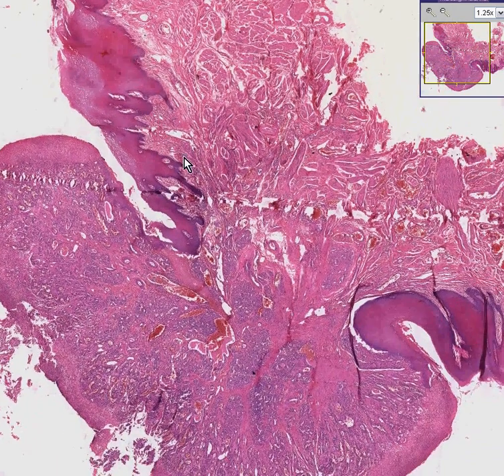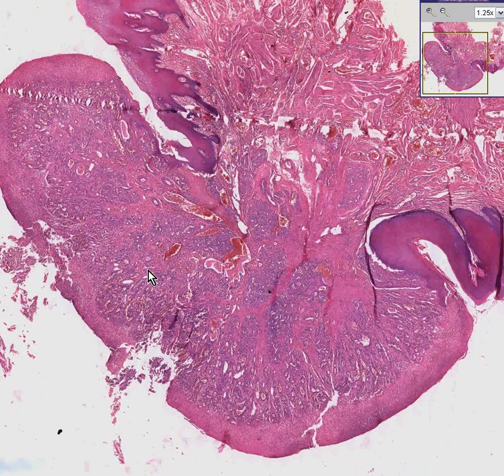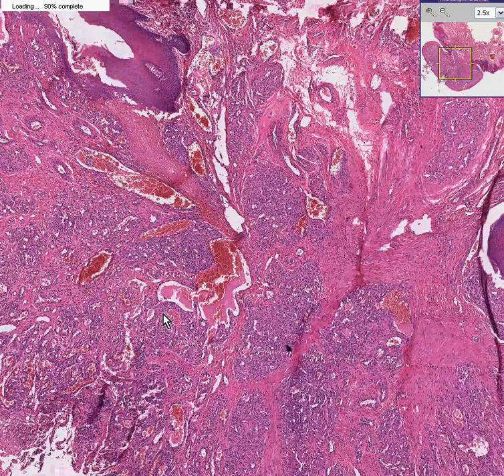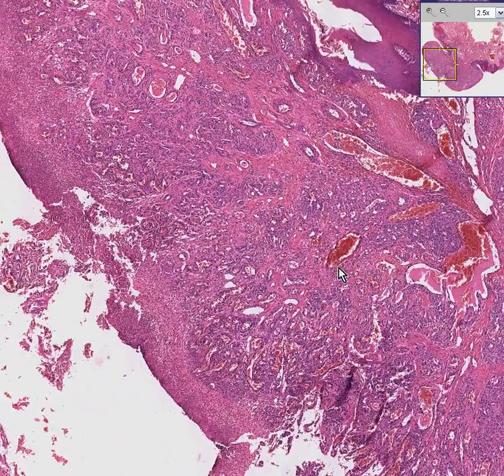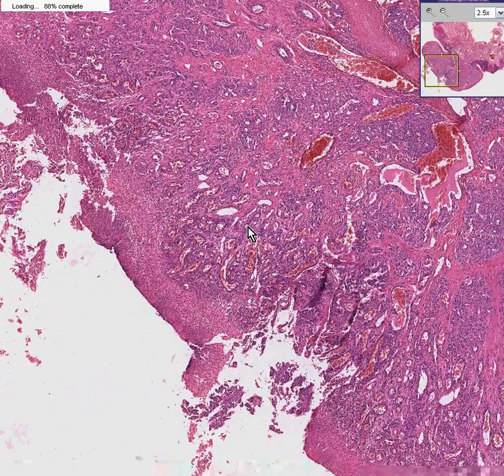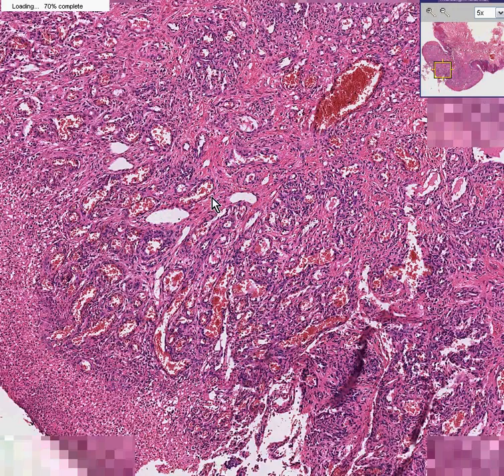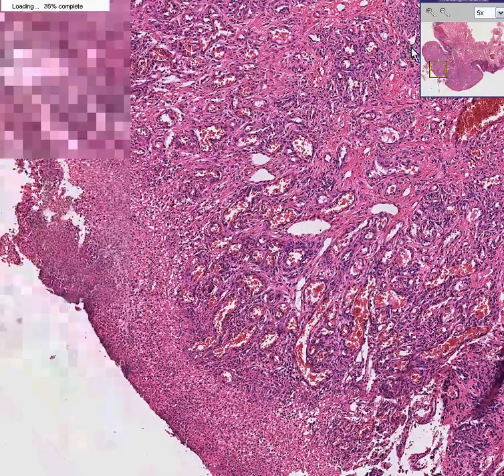It happens to be the mouth, and once again you can see something that looks like a polyp protruding and ulcerating this mucosa. When you look closer, it looks like it has a lot of blood vessels. You might want to call this perhaps a hemangioma, but if you look closer the mixture of cells is so intimate with normal fibrous tissue and so forth.